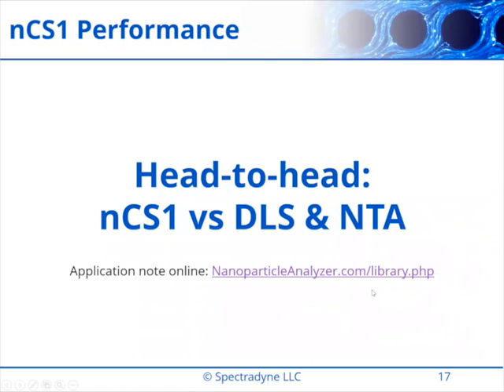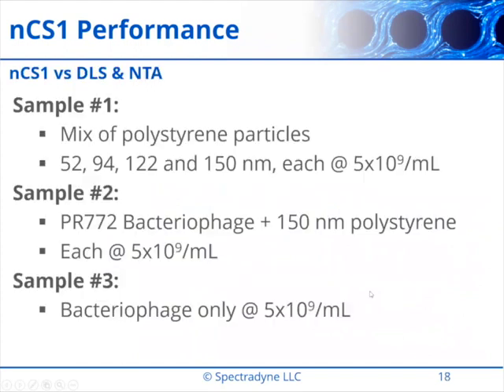So I'm going to show you 3 samples. The first is very similar to what we just discussed, polystyrene beads, and then we'll move to a more real-world example with a bacteriophage with and without polystyrene beads added. So first, let's build up this example.